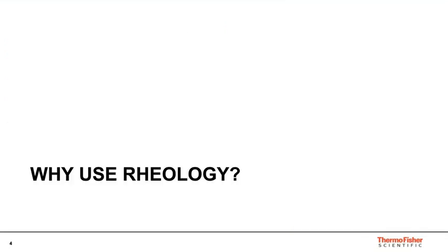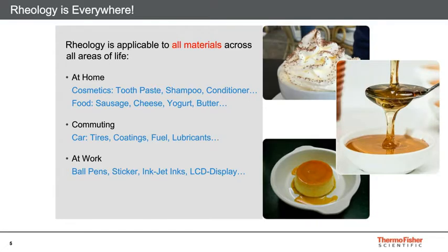So the first question is, why do you want to use rheology? And as a self-proclaimed rheologist, I'm a bit biased, but rheology is everywhere, okay? It's in all the materials we use from every aspect of our lives, from all the cosmetics and toiletries we use this morning as we're getting ready for work, from our toothpaste to our shampoos, our liquid soaps. It's in the food we consume day in and day out.